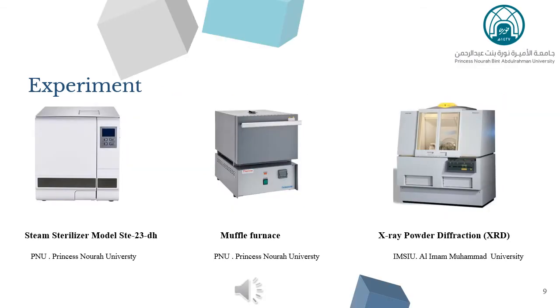The devices that were used were a steam sterilizer, muffle furnace, X-ray powder diffraction, scanning electron microscope, Fourier transform infrared spectroscope, and UV-visible spectroscopy.